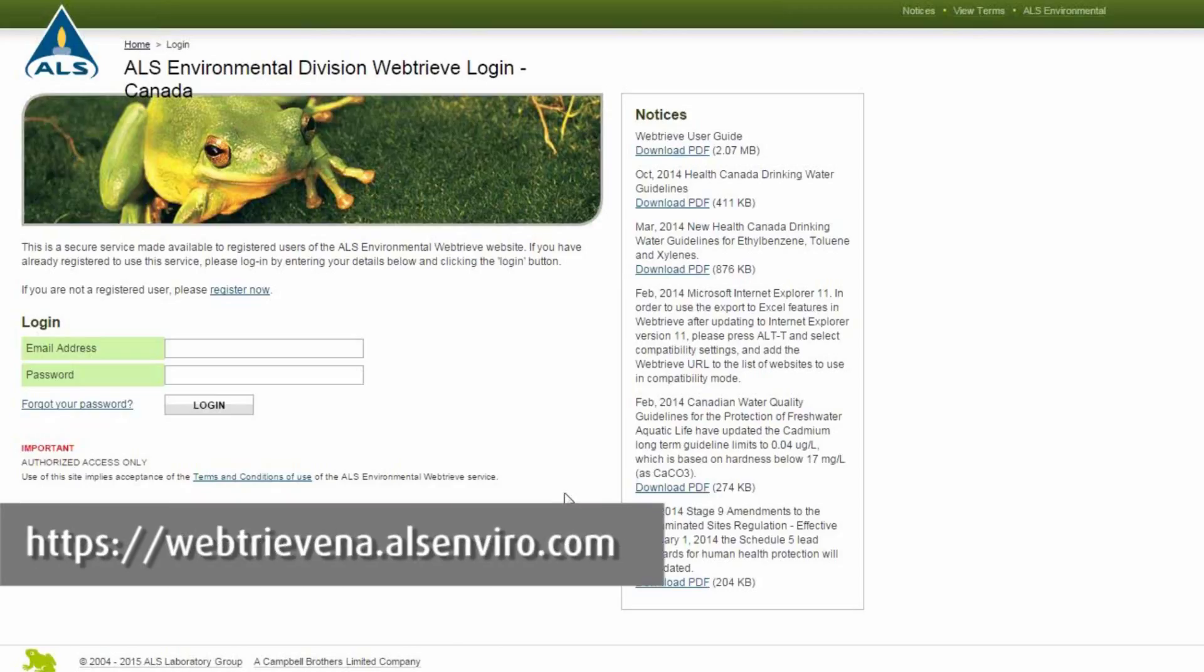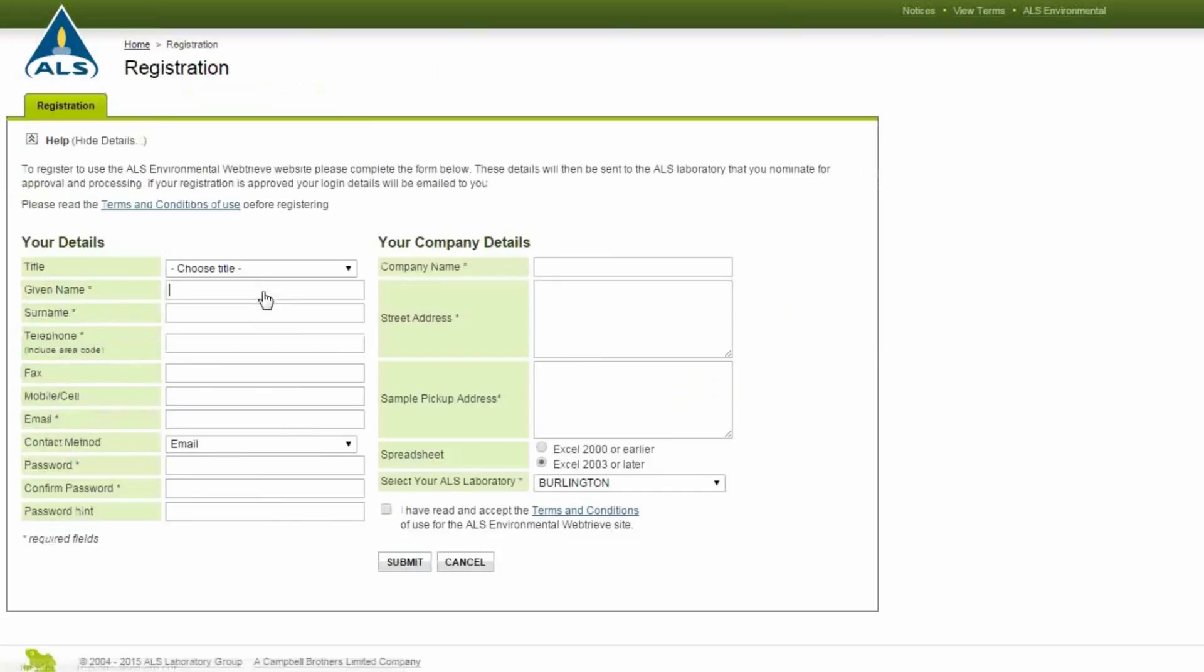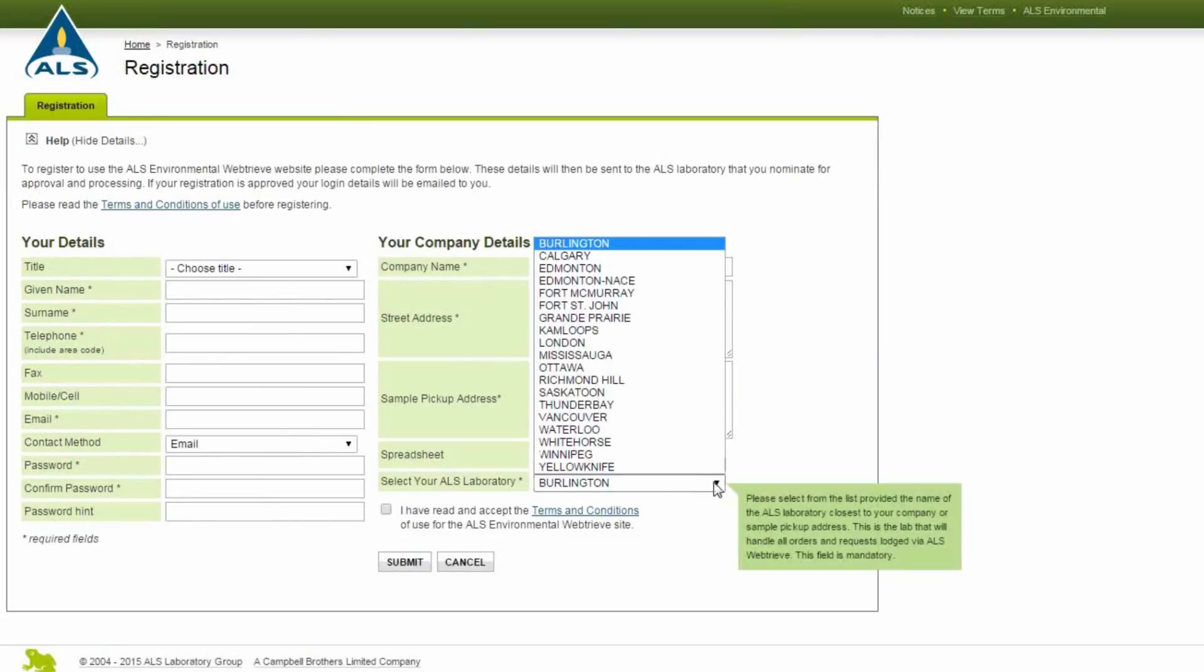To log in, visit webtrievena.alsenviro.com. First-time users can register for access by clicking Register Now and completing the form, including selecting a specific ALS laboratory.